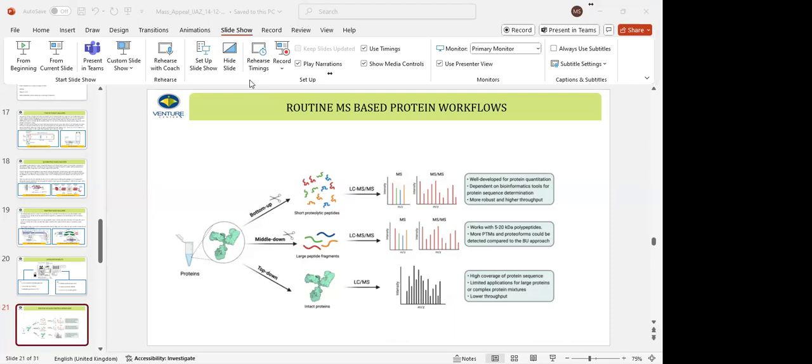Nice question. So Aditya, very nice question. Again, the answer to this may be very intuitive. In an HPLC UV detector or in a standalone UV spectrophotometer, the principle of operation is exactly the same. But in a UV detector that is connected to the HPLC, you are analyzing a continuous flow of a sample. If you have used the standalone detector, you fill a cuvette with your sample and put it into the detector and then it analyzes. But in HPLC, you have to analyze a continuous flow of the sample that is going through. So the engineering part is modified in such a way that it is able to successfully analyze a flow of the sample. That's it. Otherwise, the UV lamp is the same, the detector is the same, the grid, the prism, everything is the same. Next question.